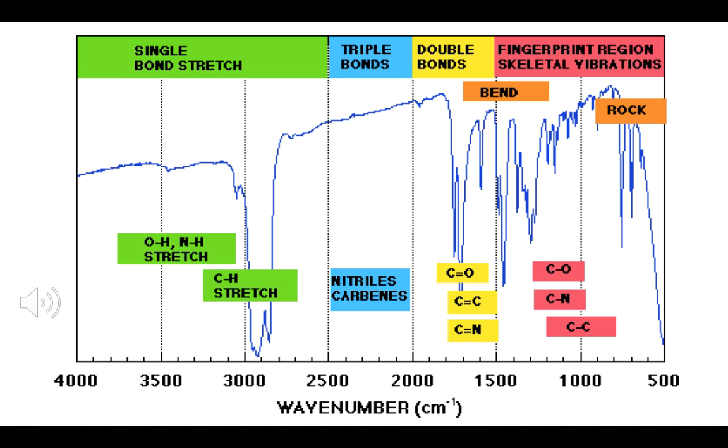So frequency will cause certain bonds to vibrate, and they can either stretch, twist, wag, or do scissoring motions. And when they do this type of movement, they give off a certain frequency, which feeds back to a computer and processes whatever frequency was given back, and then you understand how the structure is. So if the molecule is symmetrical, like diatomic oxygen, nitrogen, fluorine, you will not be able to see it using IR. So IR depends on asymmetry.